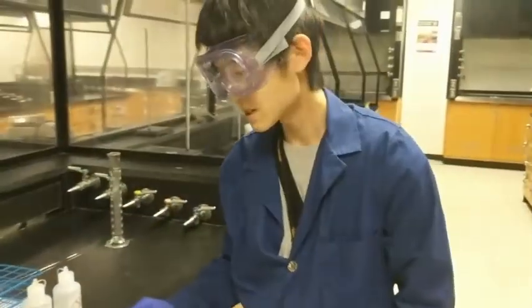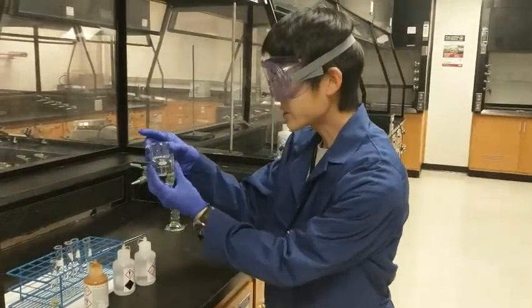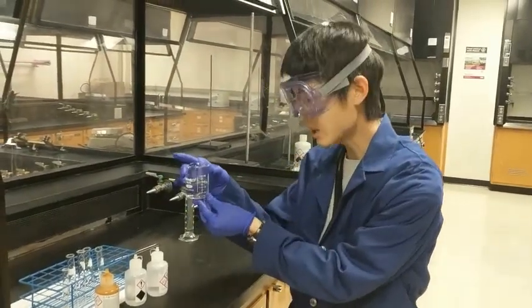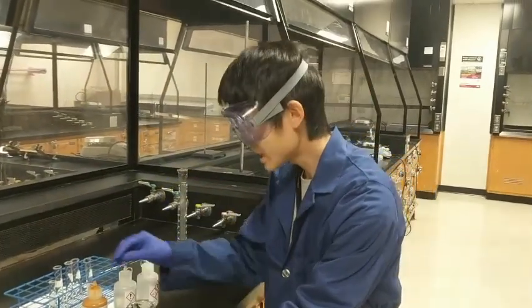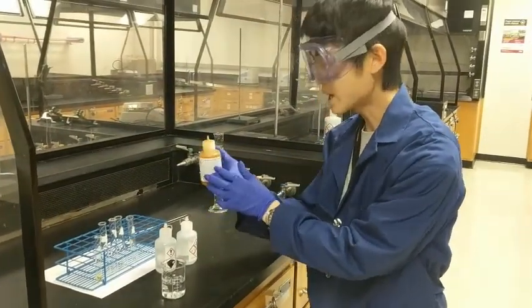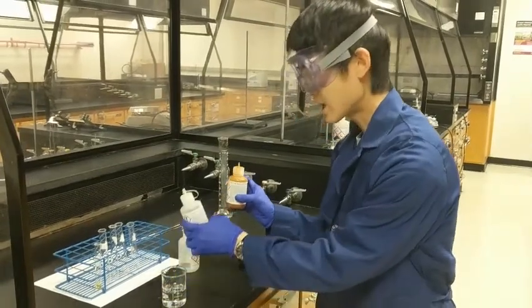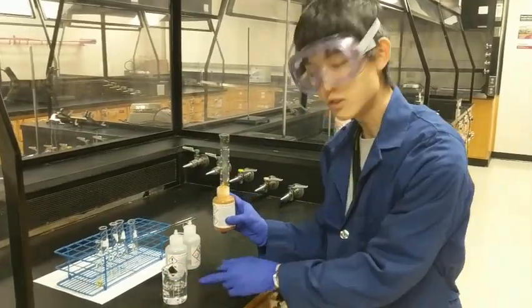The first thing that we are going to do is measure out around 50 milliliters of DI water, and then put 20 drops of iron(III) chloride solution and 20 drops of ammonium thiocyanate solution into the beaker.